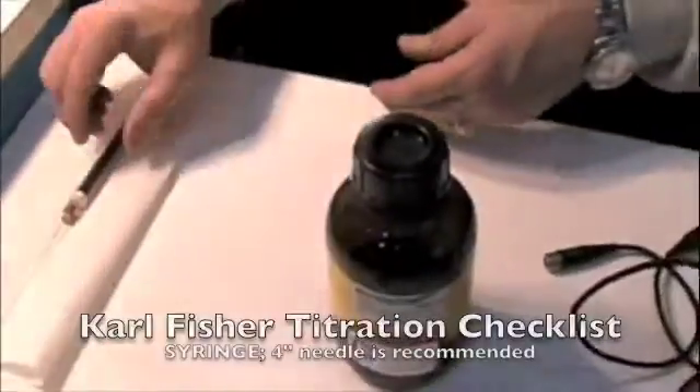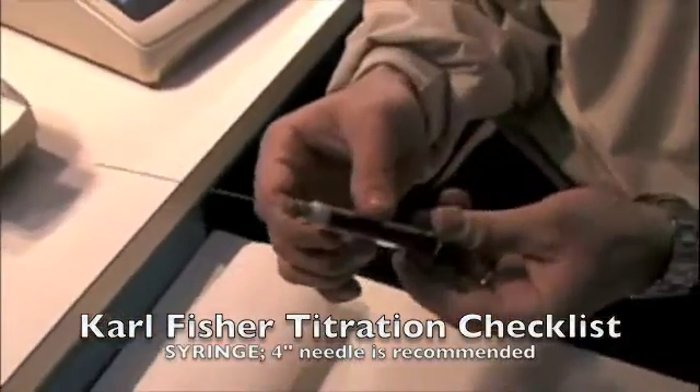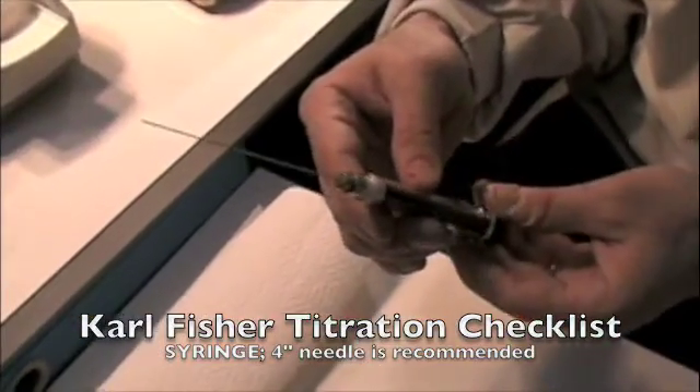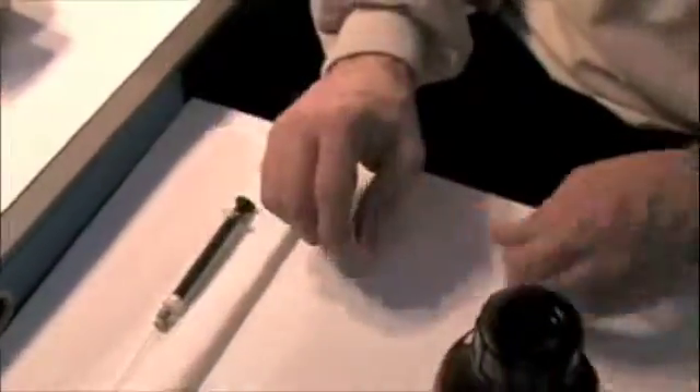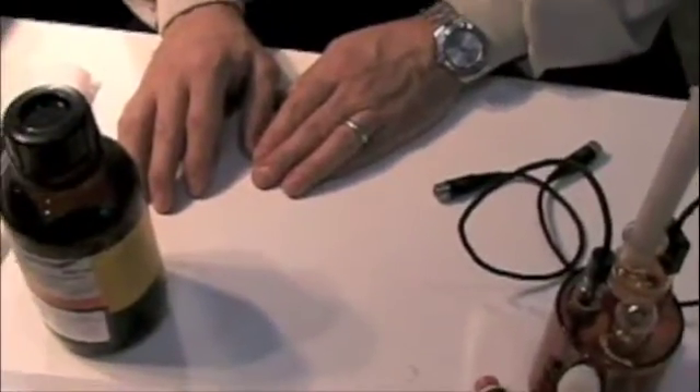You'll also need a syringe so you can deliver the sample. This is a gas-type Hamilton syringe, and those are the items you will need to conduct a test.